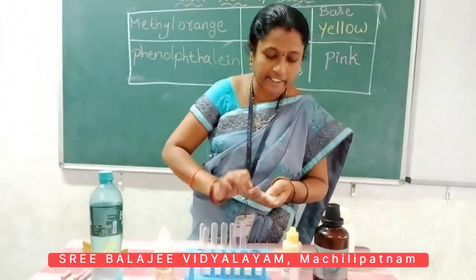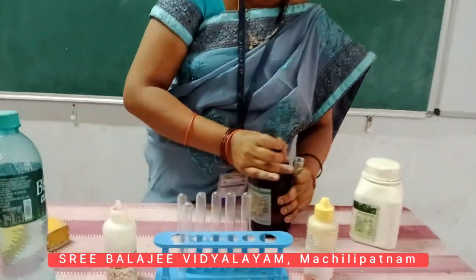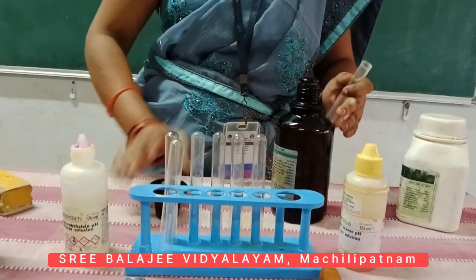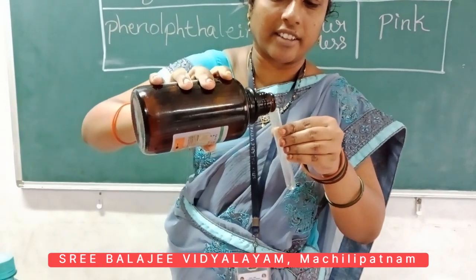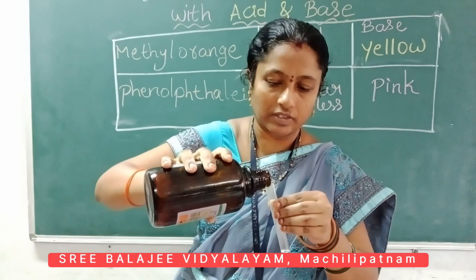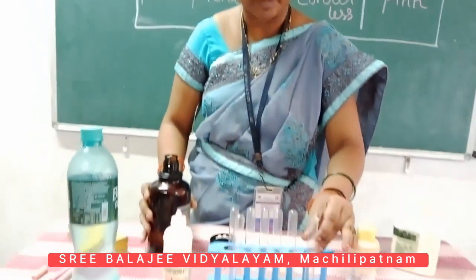First I take some amount of nitric acid. Nitric acid is a strong acid. I take some amount of nitric acid in one test tube.